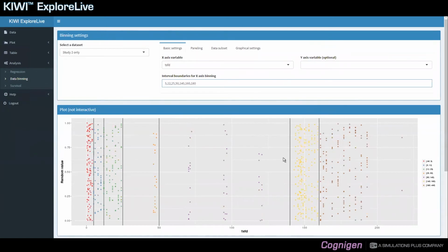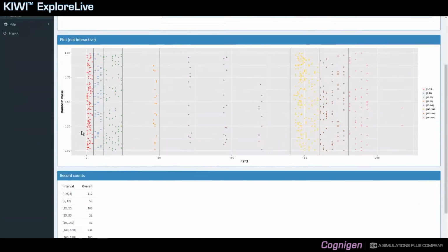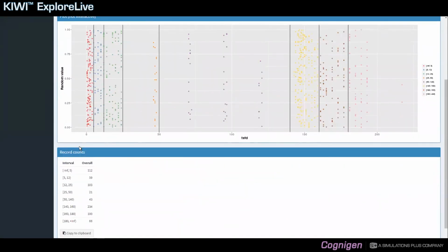And just for the sake of it, a last one. So your information is shown in a graphical manner on the plot setting, but it is also summarized in a more numerical fashion in a panel below.